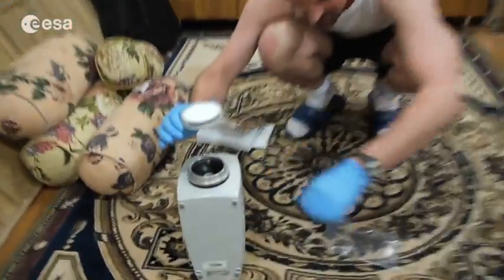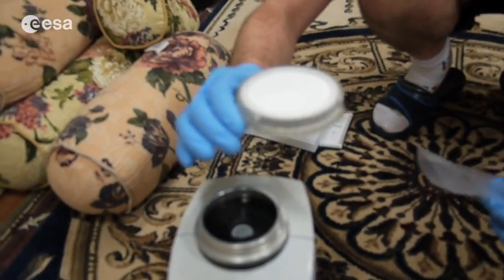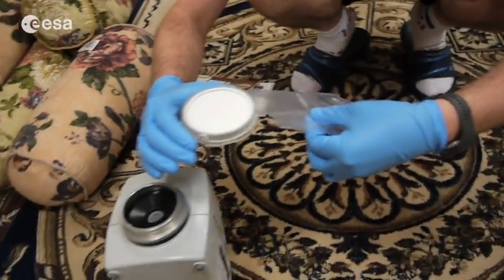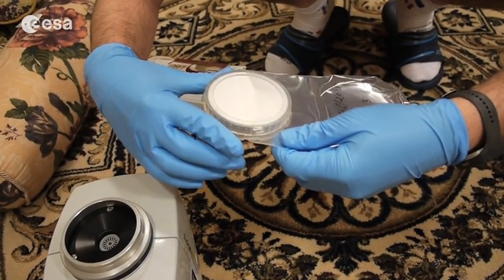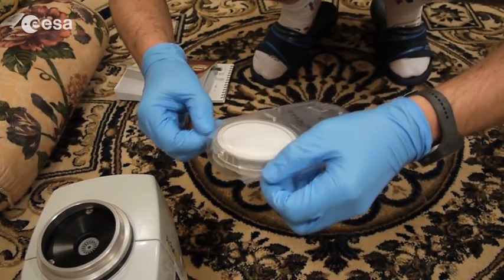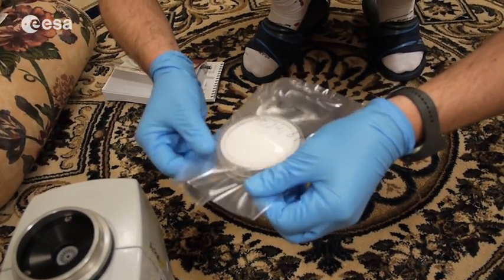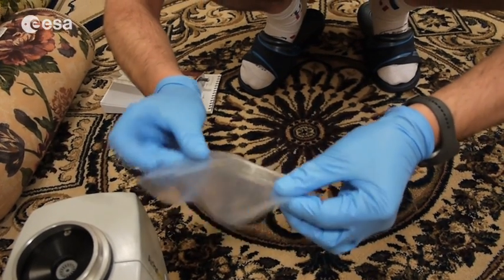I must be very careful because there will be some culture on this glycerin and nothing must touch it. The inner side of this bag is sterile, so it's okay. But my finger shouldn't go inside. So it's kind of tricky.